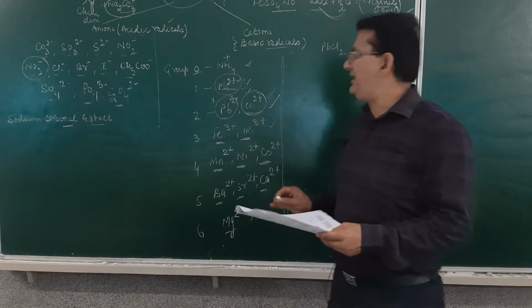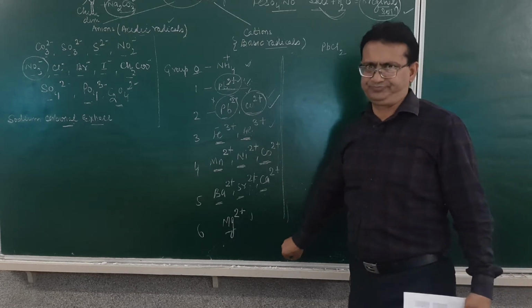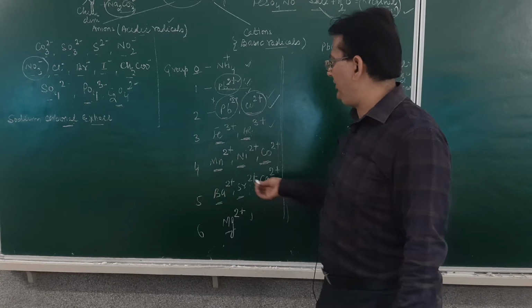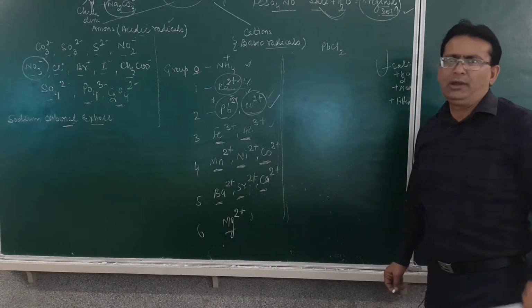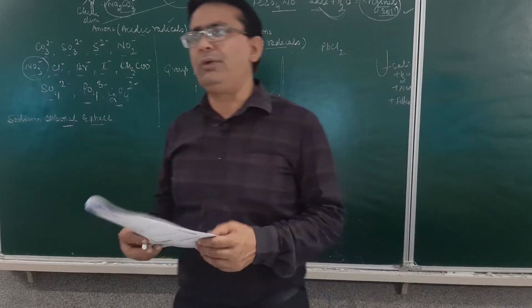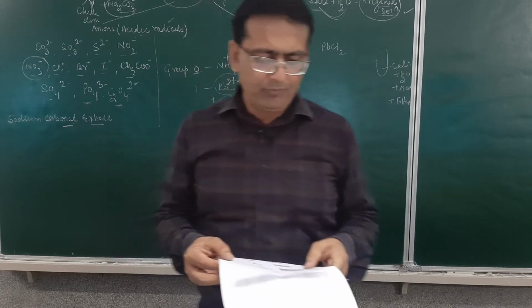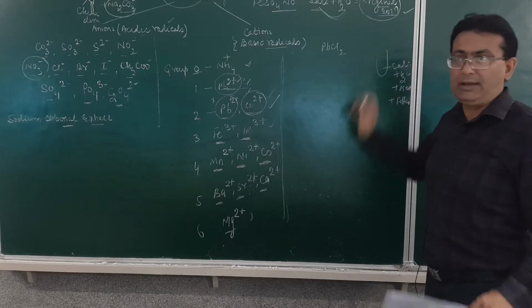Now, the various cations in the syllabus are classified into various groups. These are ammonium, lead, copper, ferric, aluminium, manganese, nickel, cobalt, barium, strontium, calcium and the magnesium ion. How do you do this? You may look at the table given to you. Look at this table provided to you. Now see over here, what do we have? We have our original solution. We prepared this solution. Am I clear?